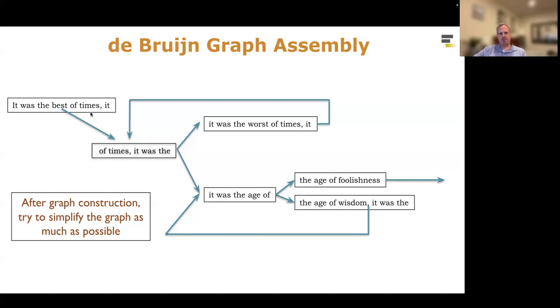Now here in English, just by looking at this, we're pretty sure the book starts here, and then would cycle through once here and once there, and then make our way out. And in English, that would generally be a safe thing to do. Although if we're going to be talking about de novo genome assembly, it is common to go through those cycles many times. That would be a tandem repeat.